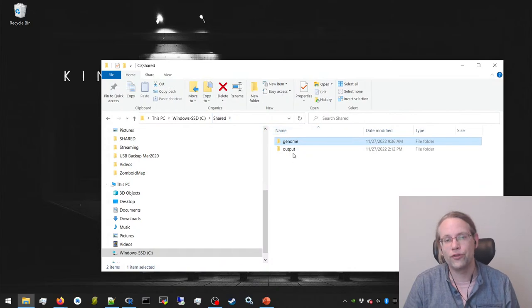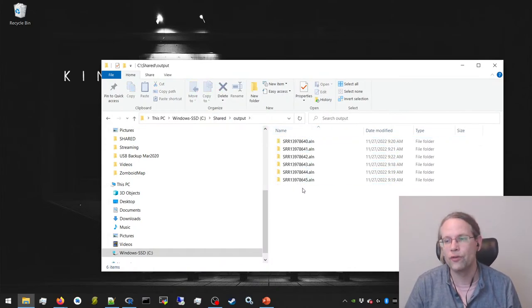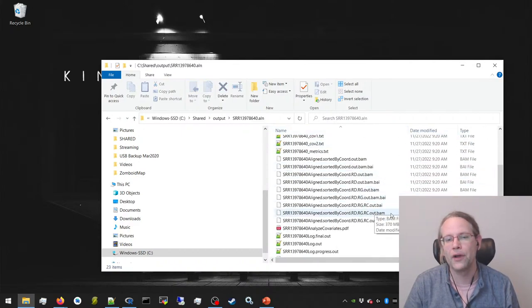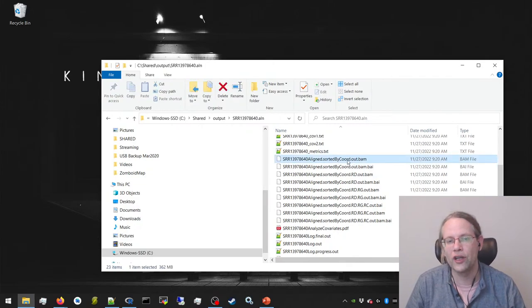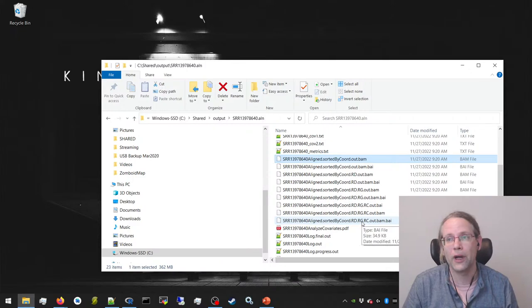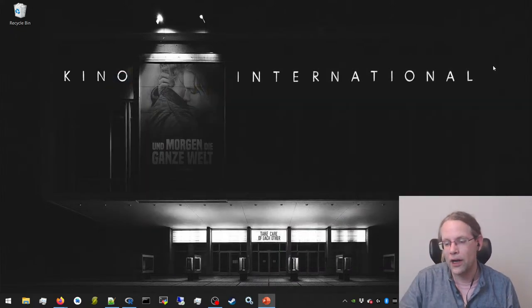So just run the script six times, once for each input sample, and after you've run them, just copy it over. And we're only going to use this BAM file here. So we're going to use the BAM file from the latest point in our pipeline, right? But of course, we could run it at every point in the pipeline. Because we could also say, well, take just the aligned reads, which have not had duplicates removed, or which have not got the read groups in there, or which have not been read corrected. All right.